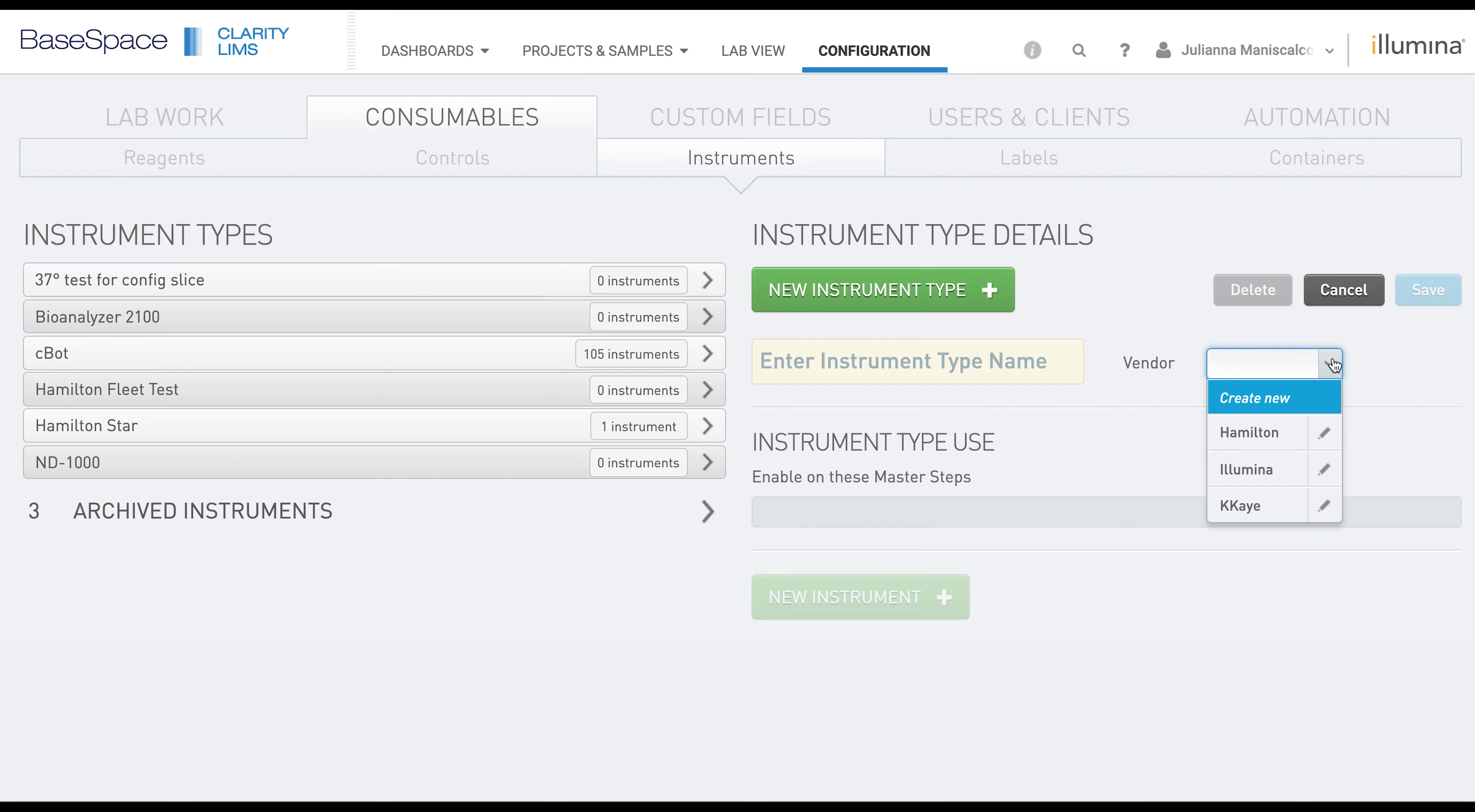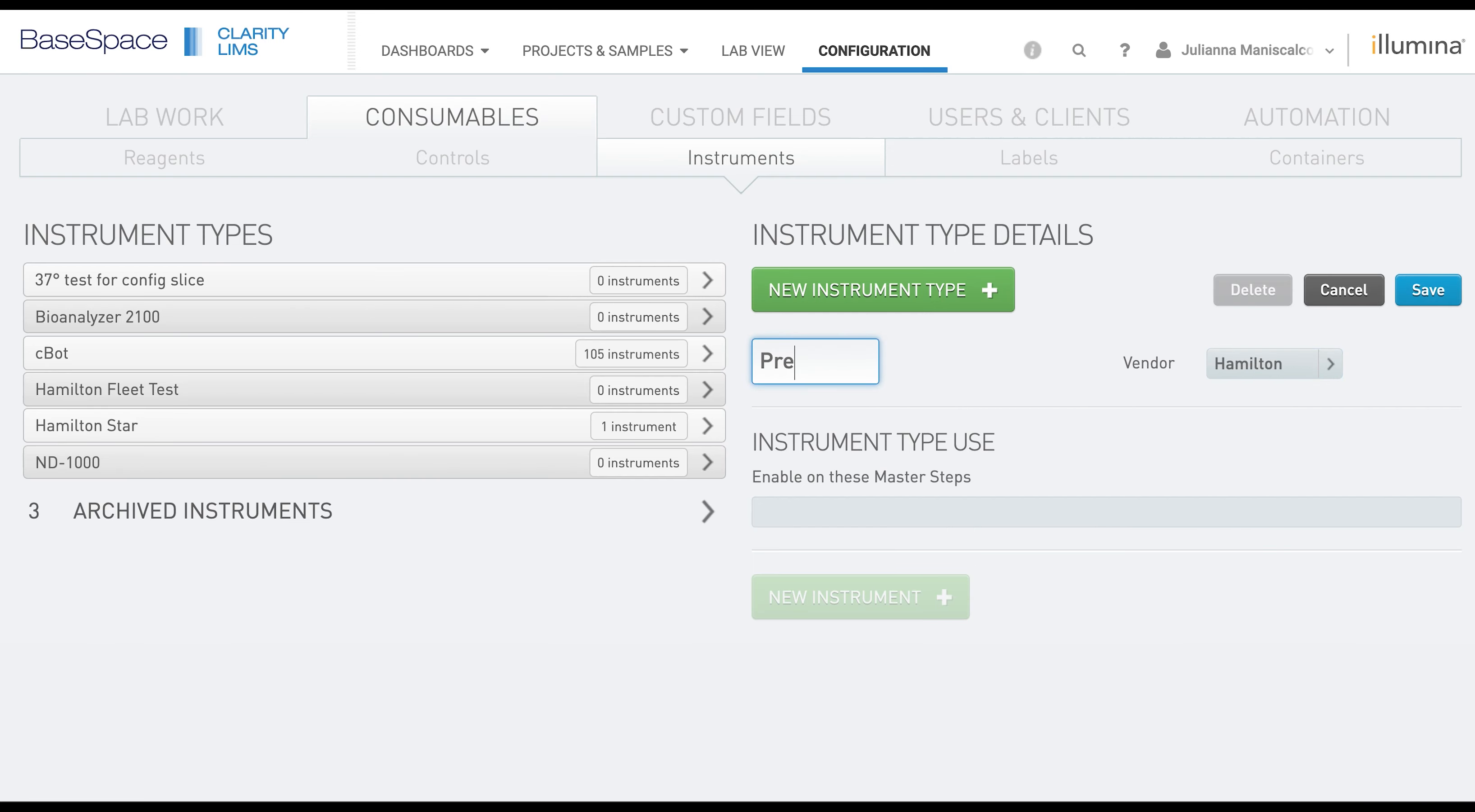For this example, we're going to create a fleet of Pre-Lab Hamiltons and the vendor will be Hamilton. Then we'll click Save.